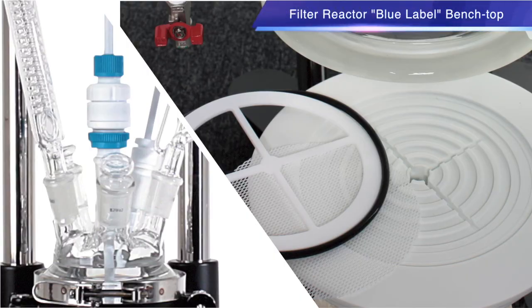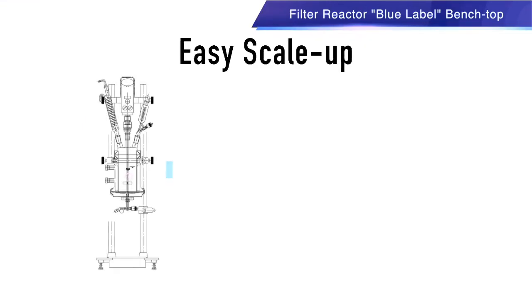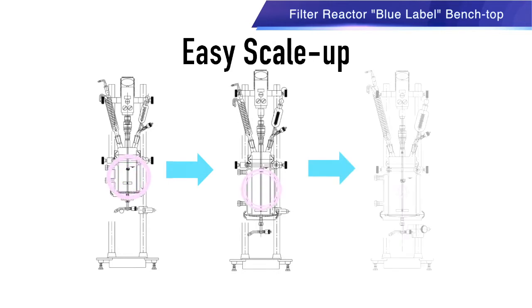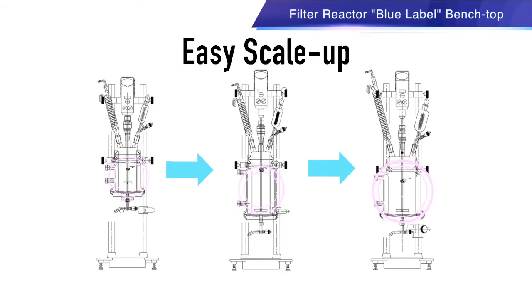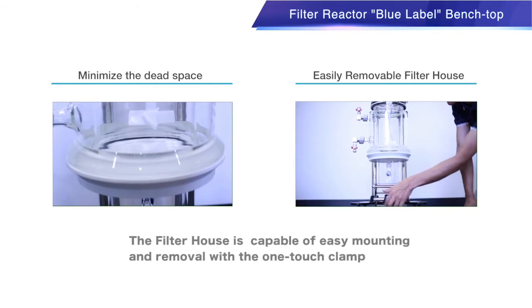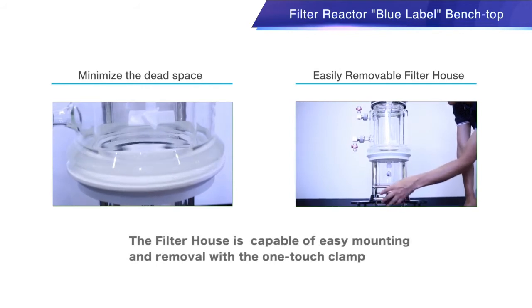This is the Blue Label Benchtop Filter Reactor Unit. It is a complete one-set system for laboratory use. Sizes range from 1 liter to 5 liter capacity. The chassis allows for interchangeable scale-up. Simply change the vessel as required.